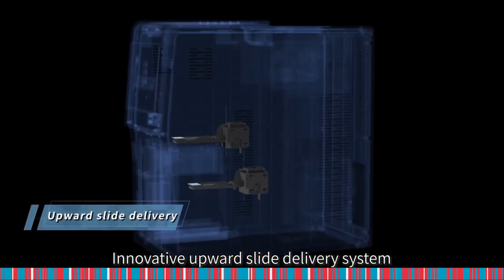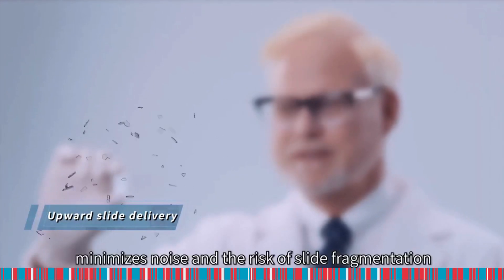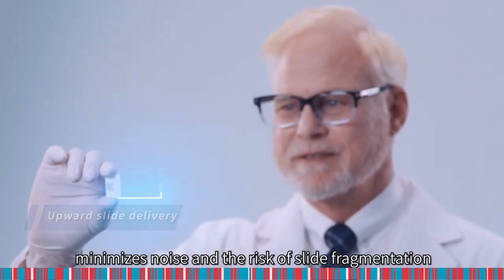Innovative upward slide delivery system minimizes noise and the risk of slide fragmentation.